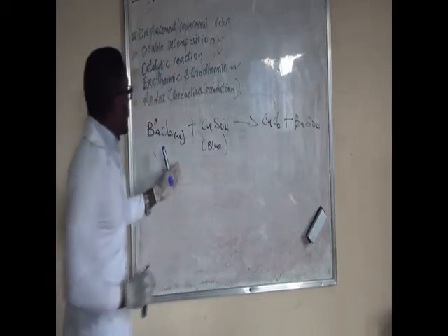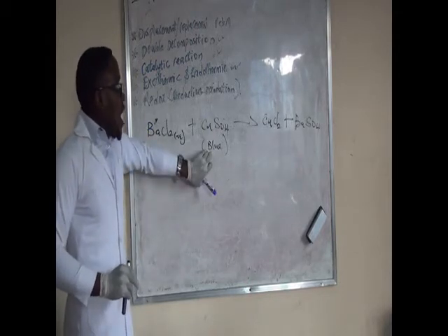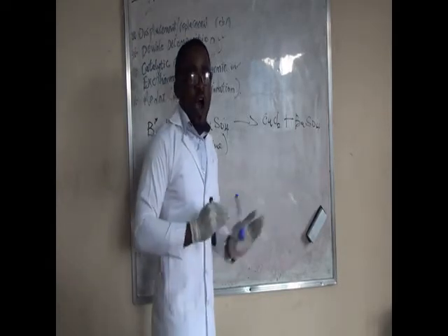Right, we look at it, you see that barium chloride reacts with copper sulfate. This blue color would tend to change immediately. Either it gives you an undissolved substance.